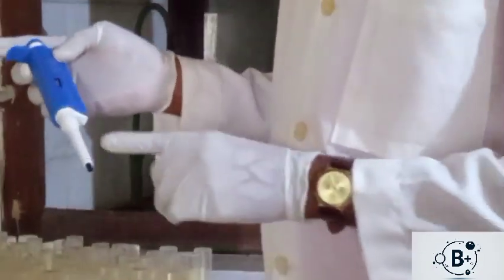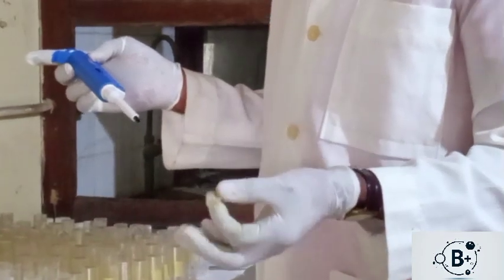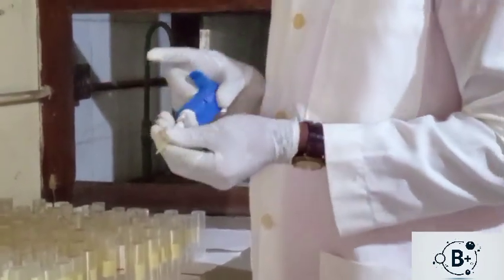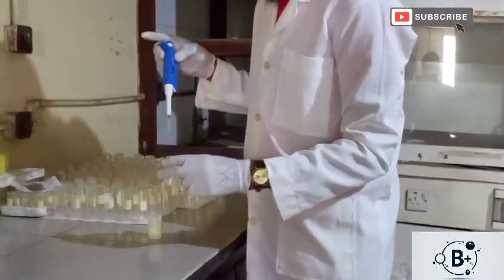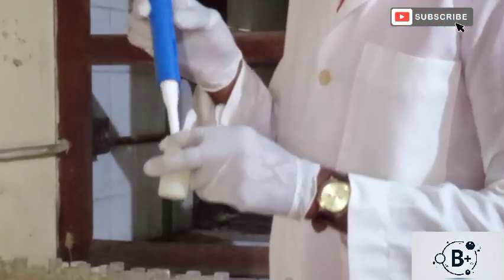Then I will now have to fix a tip. We have different tips. We have the P10, P20 in that order. But this P10 should be able to take care of the volume I want. So I will mount it this way here. Then we dip it gently into the liquid, just halfway into the liquid.